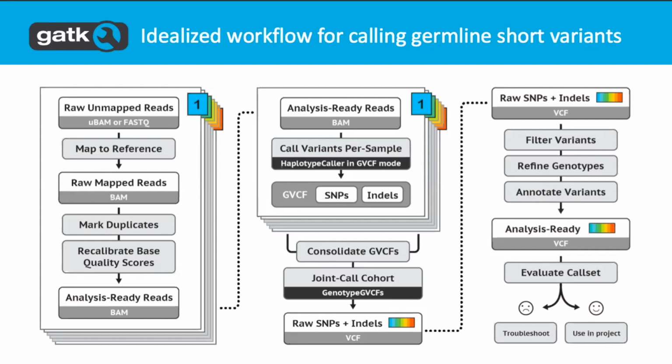Currently, CNN can be used on only one sample, but the future direction is to use it on multiple samples. But I think you can use it on more than one. It's just that the advantage is demonstrated on a single one, isn't it? Am I wrong? Hang on a tiny bit.